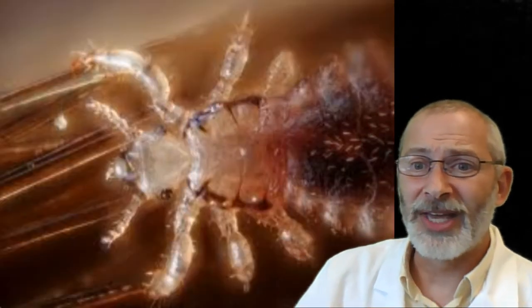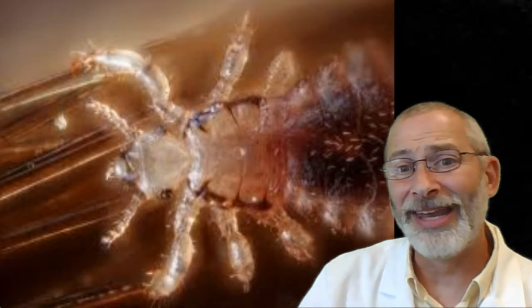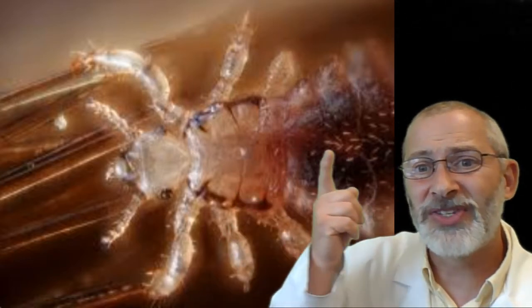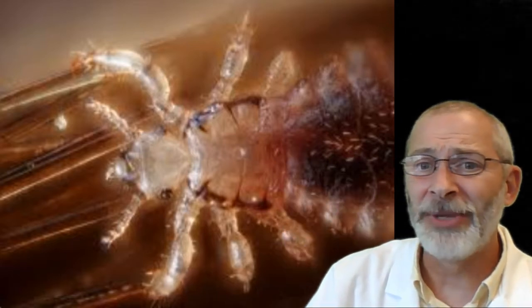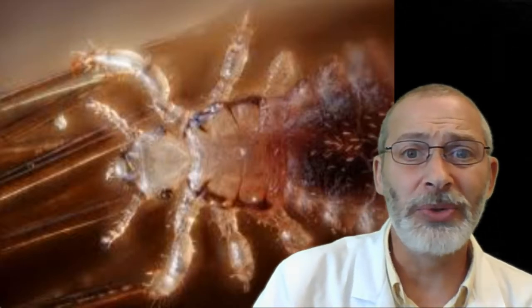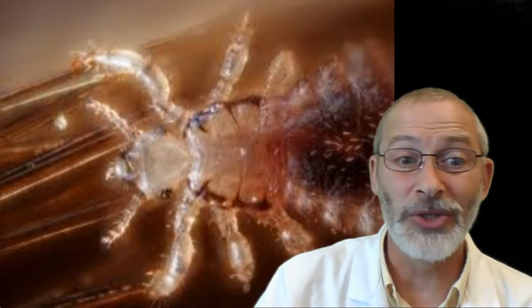Here's a head louse that is special to me, not because it was on me, it was on someone else that I removed. And I made this slide myself, and you can see it is filled with someone's blood. Head lice are not uncommon, especially among kids such as yourselves. That's why you should not be sharing hats or hoods or even masks for that matter. Keep your things to yourself so that you don't spread lice to one another.